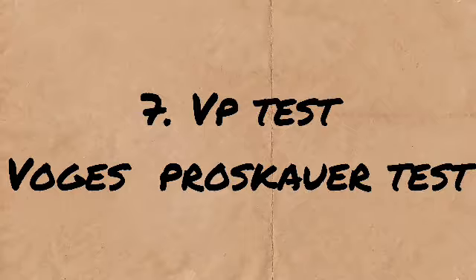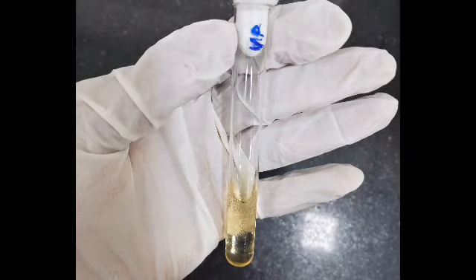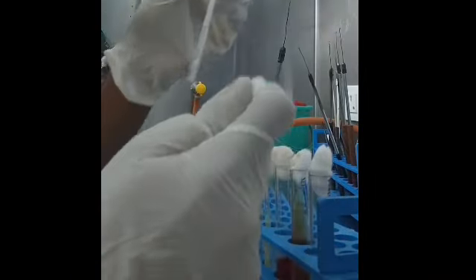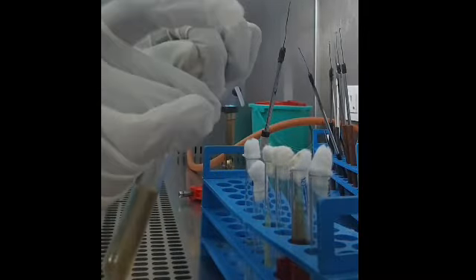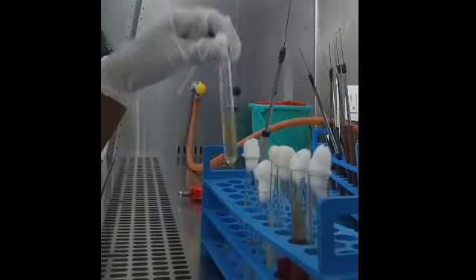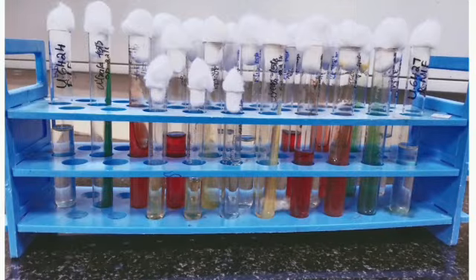The final test is the VP test or the Voges Proskauer test. This test detects acetoin production by the organism. This test is performed by adding the bacterial suspension to the Voges Proskauer medium and allowing the tubes to incubate for 24 hours. These tests together form a biochemical fingerprint of bacteria.